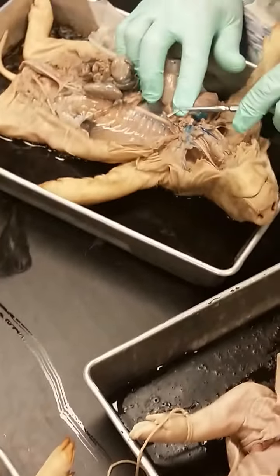And then of course this would be the liver. Here would be the gallbladder right there. And of course if I peel it away, you can actually see right down at the base, that would be the cystic duct. You all see that? You know, that's really hard. So here, it's so short. But here would be the cystic duct.